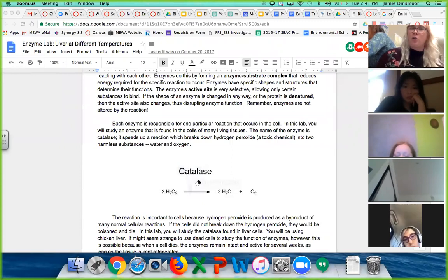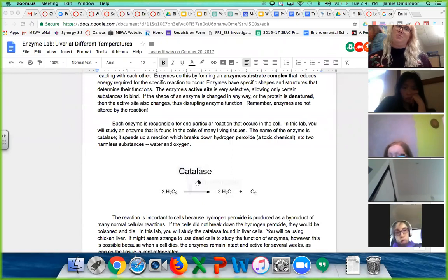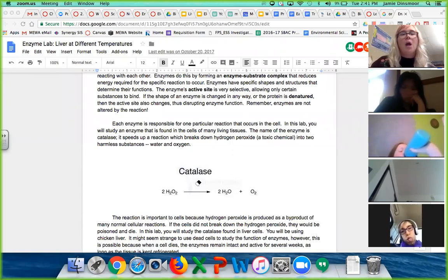It is the third wheel. Great way to describe it, right? Although it is unaffected. The enzyme does not feel sad about being the third wheel. That's its job, it's happy. So in this case, we have hydrogen peroxide. Common household item. What does this get used for?